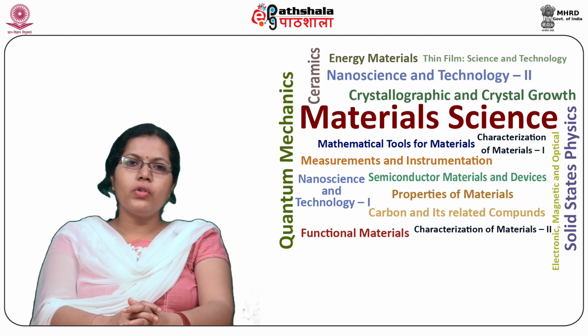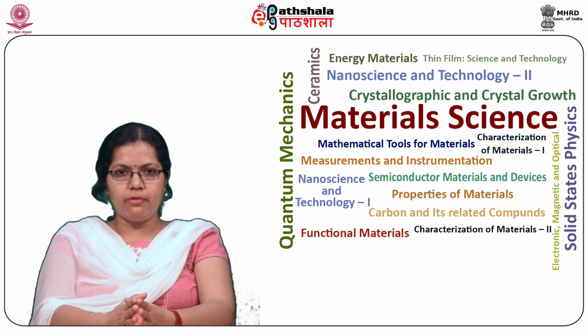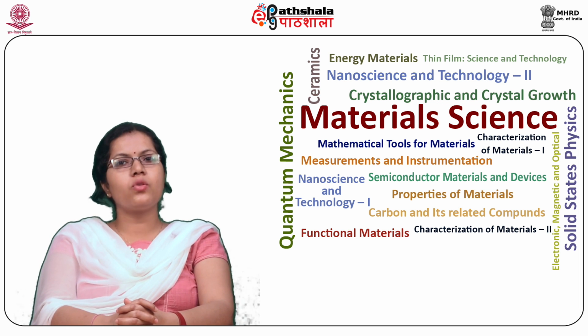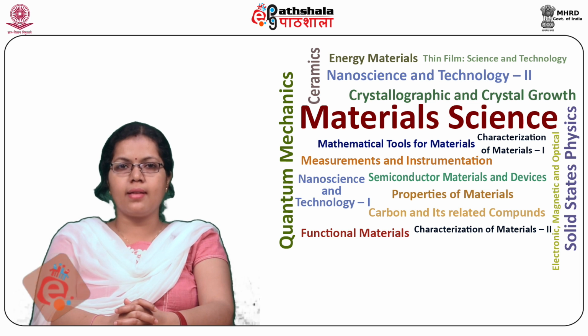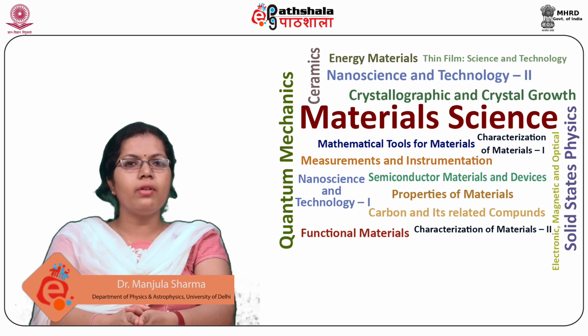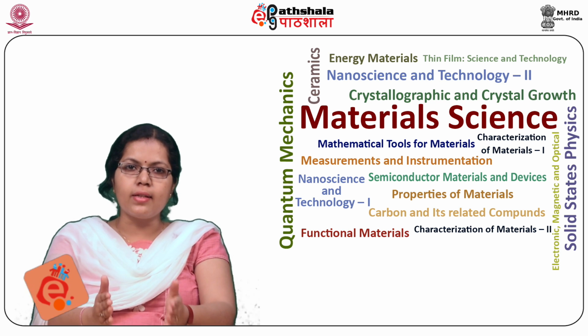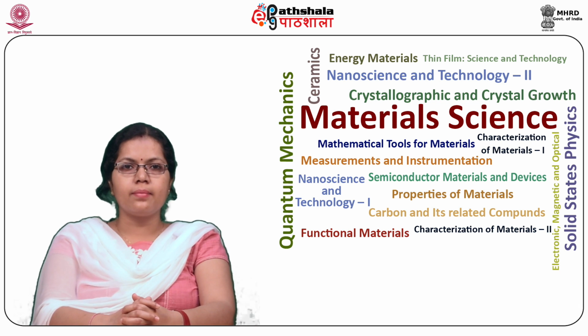So students, let us summarize what we have learned in this module. We have learned about the principles and instrumentation of the UV-vis IR setup. First, we understood its principles, then we moved over to the instrumentation, and finally, all its instrumental components were discussed. Thank you.